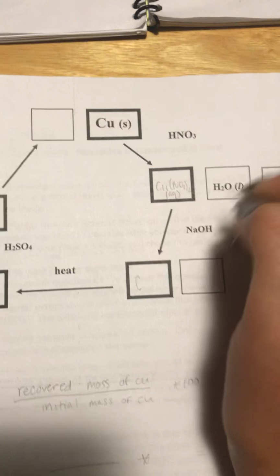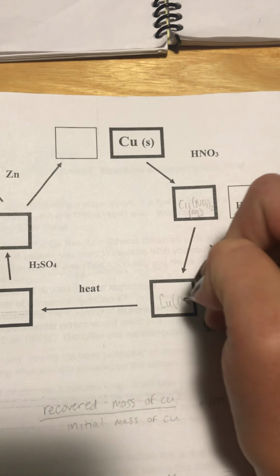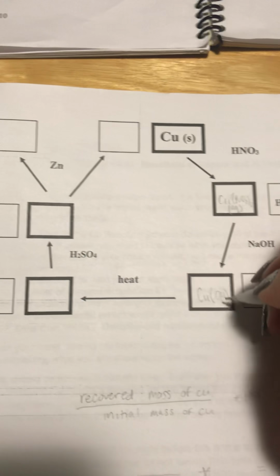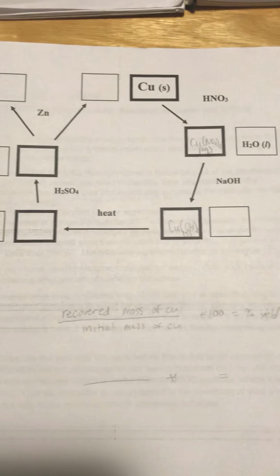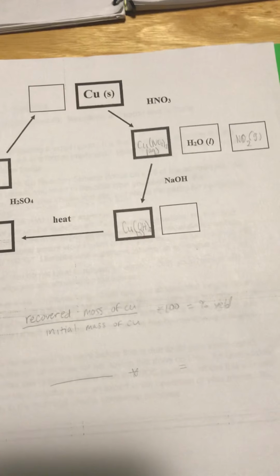Our copper hydroxide, so let's see, CuOH2, is seen as a solid, as a precipitate. So basically, it turns our solution into a dark royal blue, and it becomes very cloudy and thick, and then you can see the precipitate start to form, and it's very thick throughout.